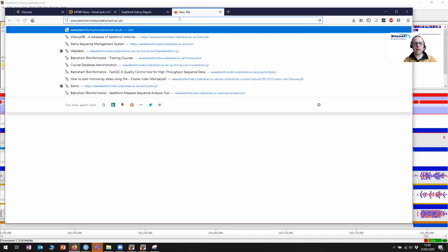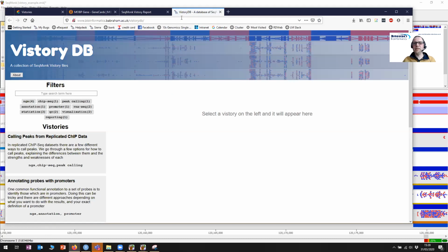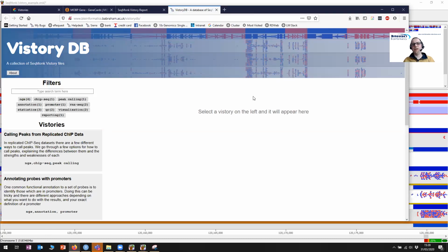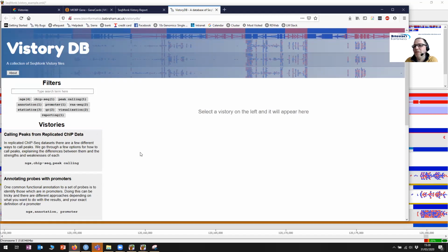If you go to the bioinformatics homepage and then go to Vistory DB, this is a collection of Vistories that we've used to illustrate different types of analysis or different problems within SeqMonk. There's not a huge amount of stuff here at the moment. We've put some things in, but there's more to come. If you have any requests for things that you would like us to put into a Vistory and insert into the database, we are very happy to take requests and see what we can do.